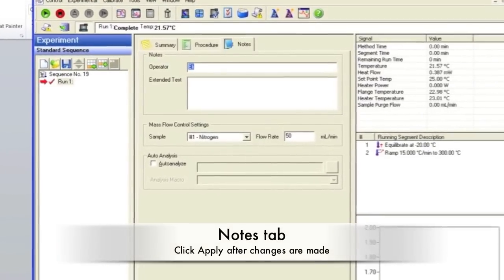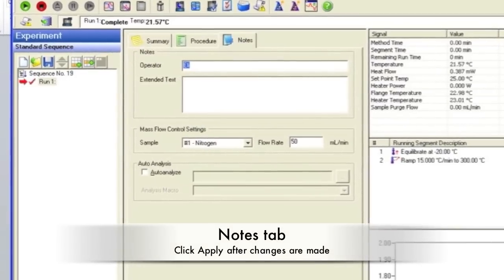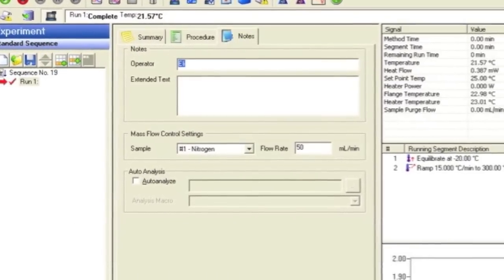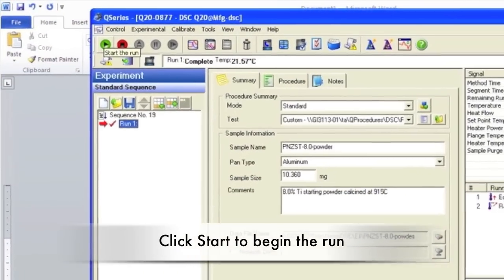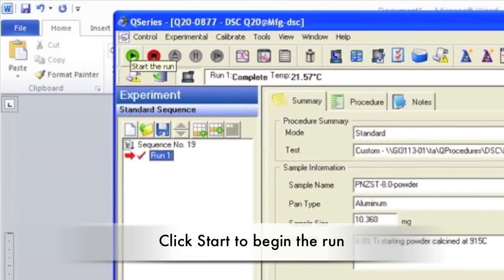Enter your name and any additional notes about the run under the Notes tab. After all your changes are made, click Apply at the bottom of the page. After all your information is set, press the Start button in the upper left corner.